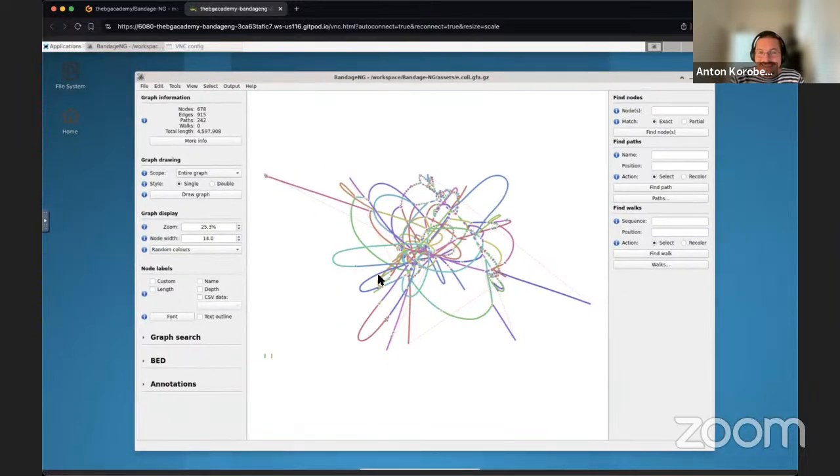That's probably the outcome of the VNC session. Sorry. But anyway, you can see that we have a couple of dead ends here, but we have the scaffolds that connect these dead ends with the probable scaffold parts. We could click on the nodes and see what's going on. You can click on the edges and paths, so you can see that it's indeed the jump link.